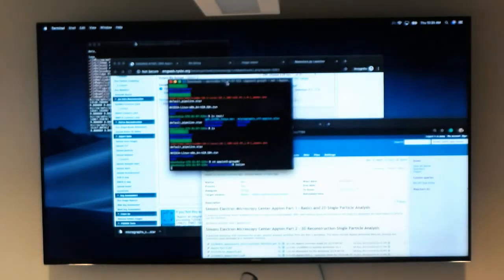Here we go. A lot of windows in Relion. And since I'm split screen, I'm going to have to look at the screen myself. Okay. So there is a command. Let me actually exit because I'll just.